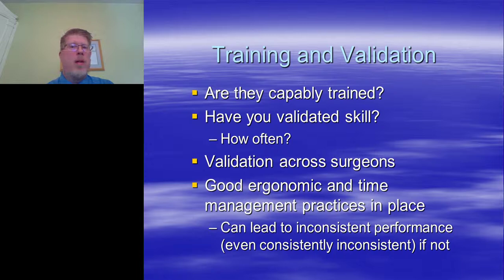We've seen for years and years, one of the truisms is mix up your test groups over the course of the day because you don't want to have this time effect. Once upon a time, we thought it was due more to the physiologic rhythm of the lab animal itself. Taking a cue from human medicine and surgery, we've kind of learned at this point it's because the surgeon fatigues and gets sloppy or is rushing or wants to get to lunch or wants to go home on time, and they compromise their work based on that. Again, it's a little thing, but it will affect your study.